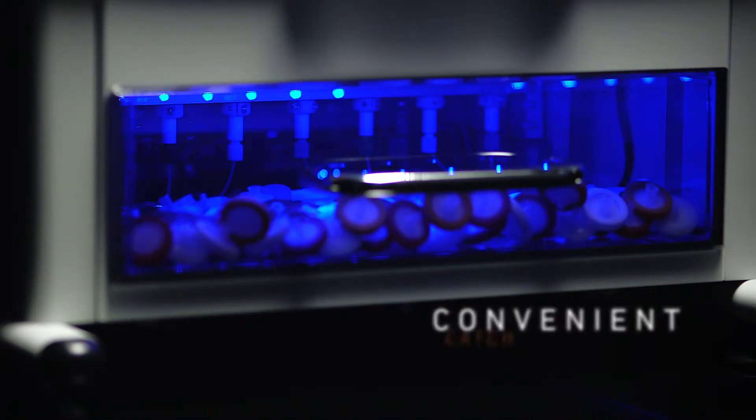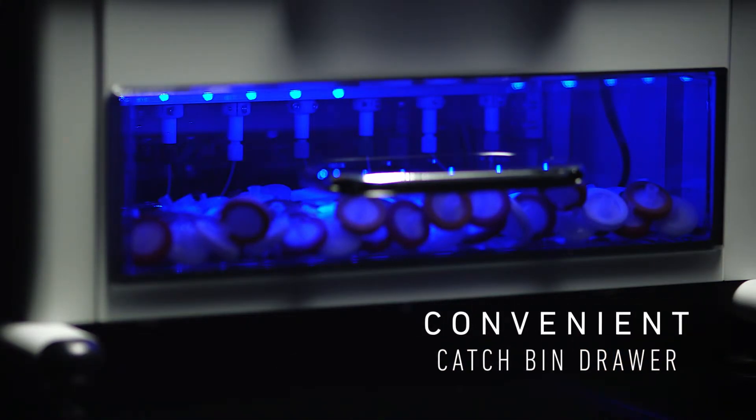Prevent cross-contamination with a pre-sample rinse routine that flushes 100% of the system. When you decide that filters have been used to capacity, the Vision Auto Filter Changer will discard them in the convenient catch bin drawer located directly in front of you.